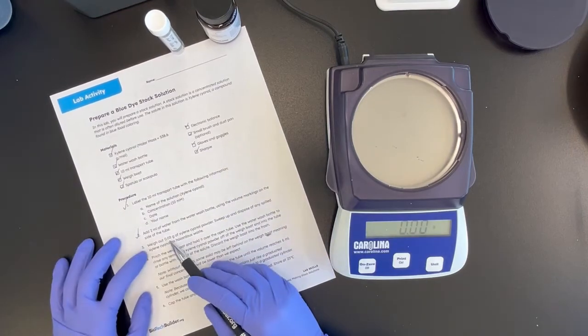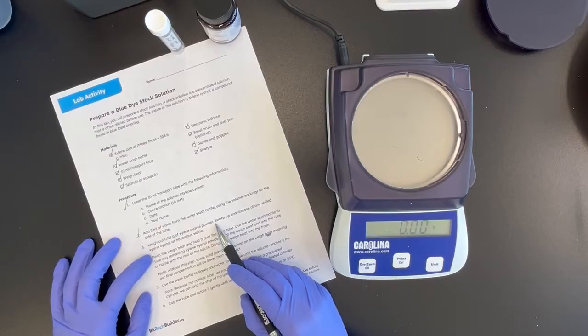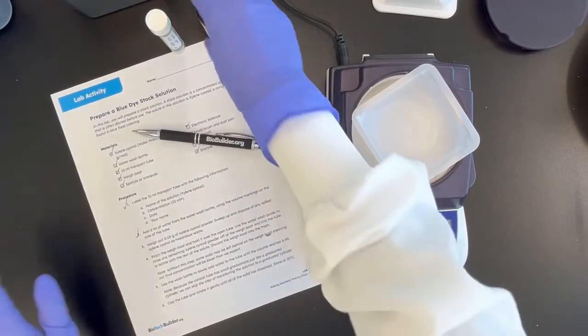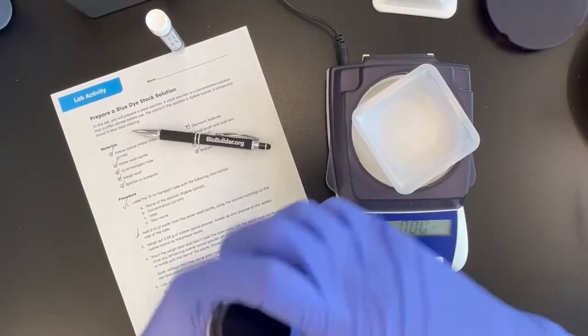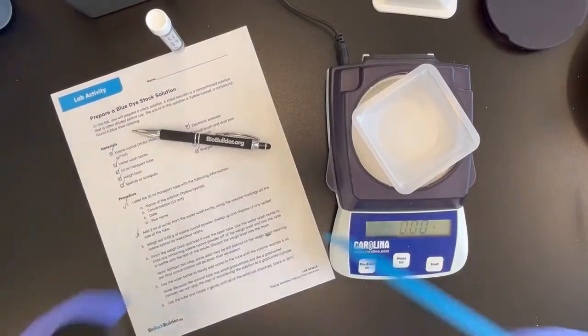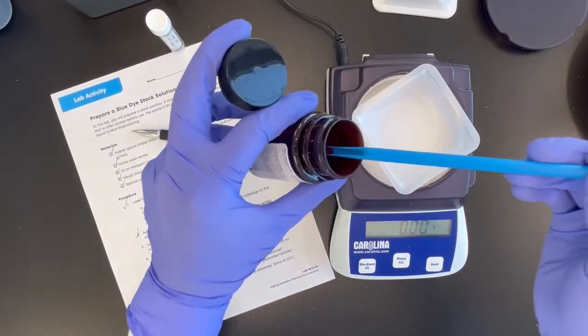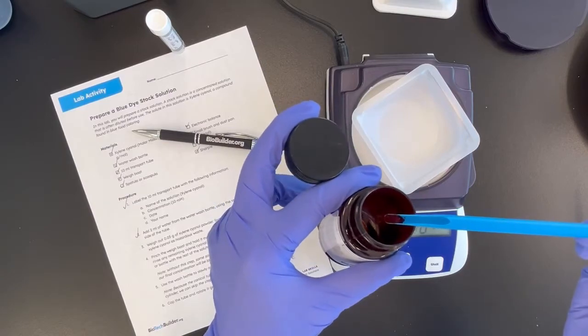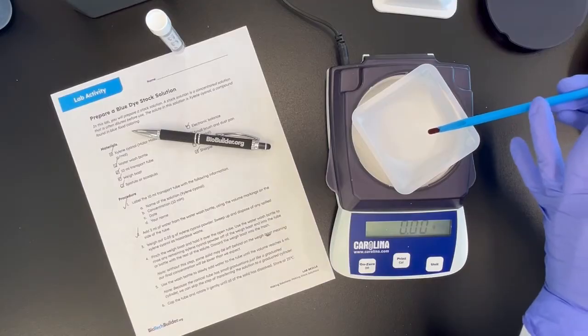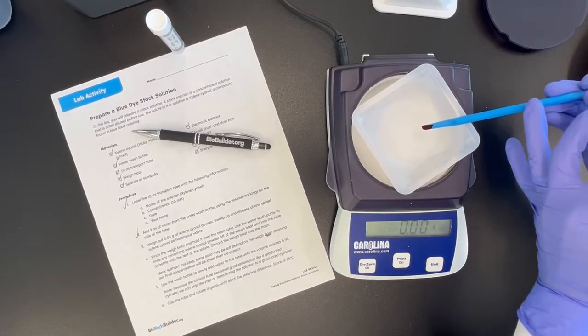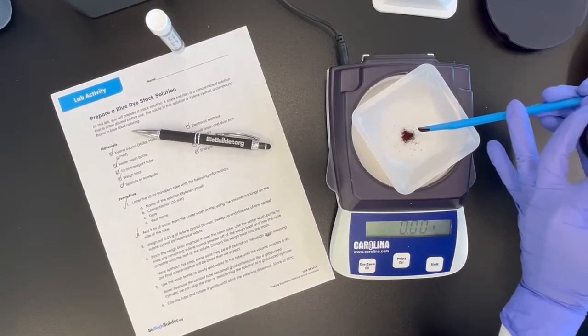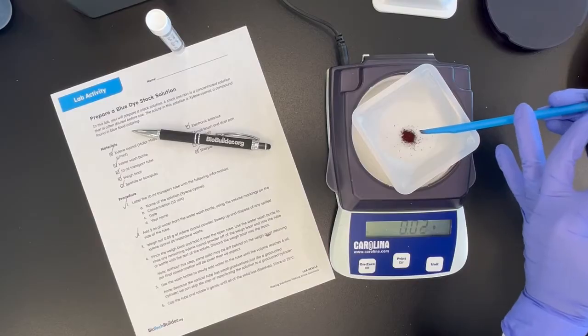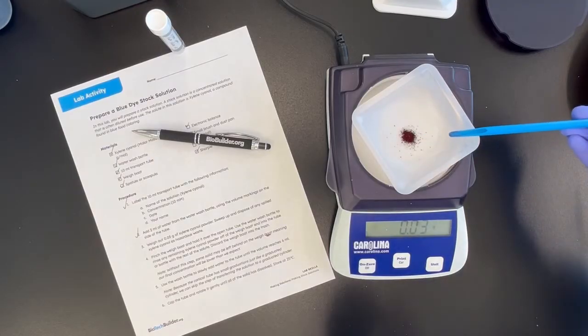So the next step is to weigh out 0.03 grams of xylene cyanol powder. So we'll take a weigh boat, set this to zero. And this is xylene cyanol. And this is a spatula or scoopula. 0.03 grams is quite a small amount. And so what you want to have the students do is to take a little bit of the powder on the spatula and gently tap the handle of the scoopula to drop the reagent off a little bit at a time. It's almost at 0.03. Okay, great.